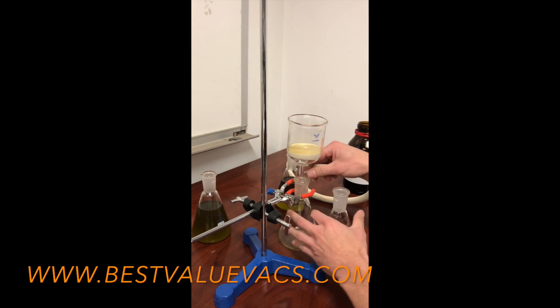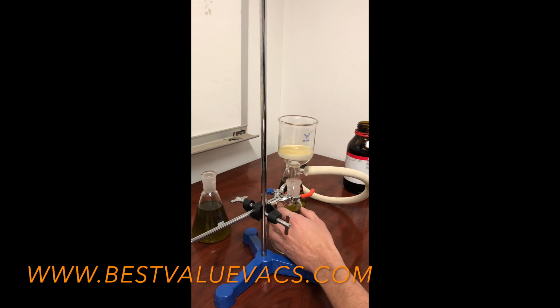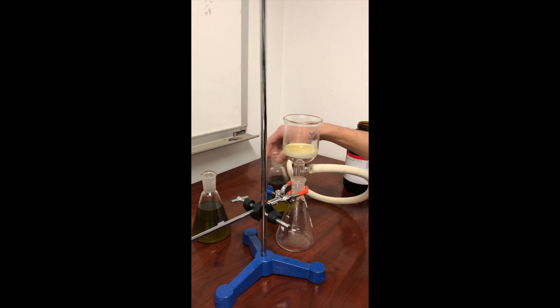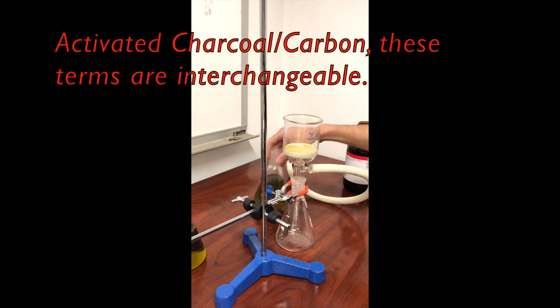We're going to swap out the collection jar and get a fresh one. Now we're going to move to a second step, which uses an activated charcoal product. So we have our step one result and now we're going to filter this through carbon.